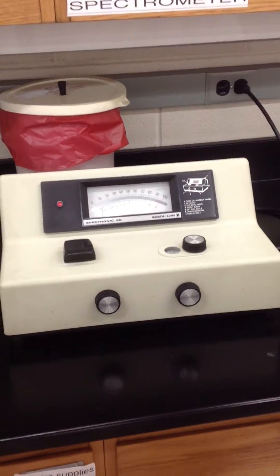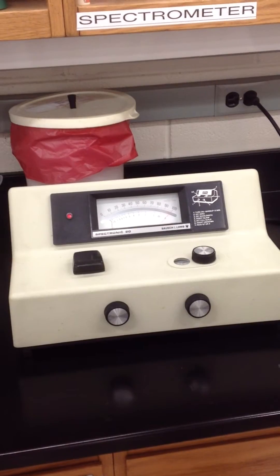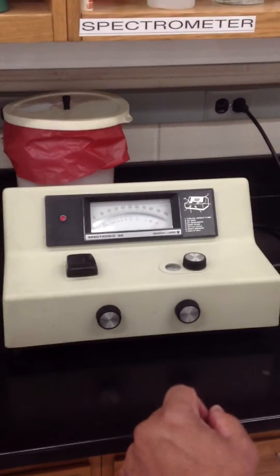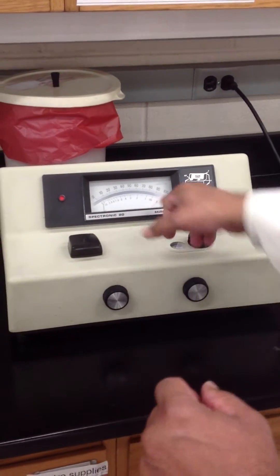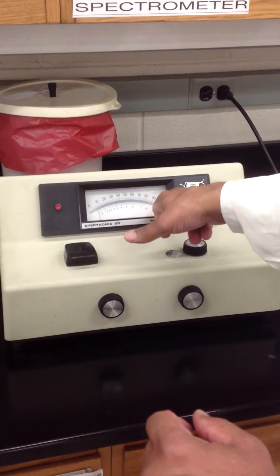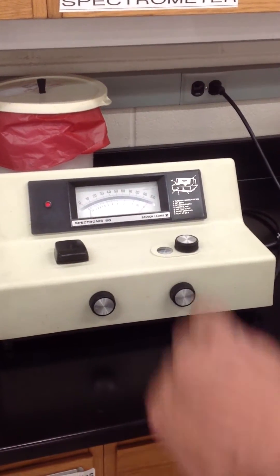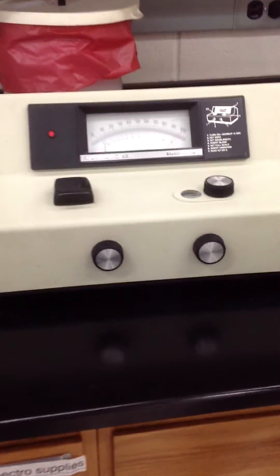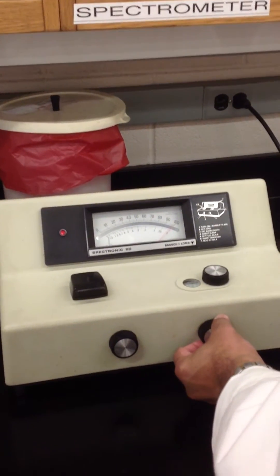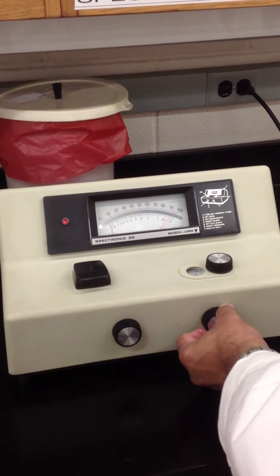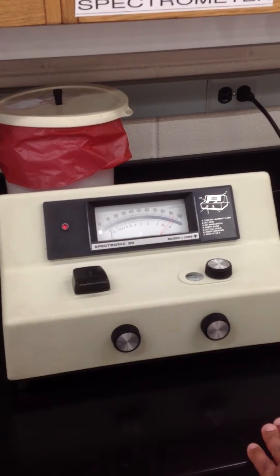So once it's set to zero, and now you want to make sure it's on zero. And when you read, you're going to read it to the closest. So you can see the absorbent scale goes from zero to two only. That's why I plotted on there, zero to two. So you're going to read it to the nearest, so if it's right here, like that, what would you read it as?